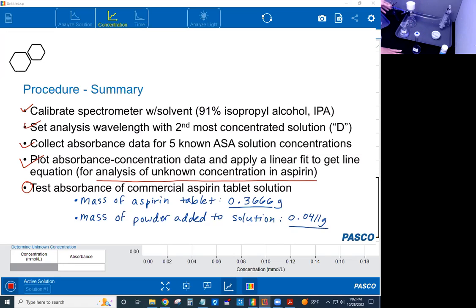If you don't have a professional vacuum system, you can set one up with just some tubing, 2 Erlenmeyer flasks, your Buchner funnel, and a one-hole stopper with a couple of one-way valves. This is the syringe that you get either in PASCO's pressure sensor or with the drop counter. It's the same syringe, so you can create a vacuum with it using this setup. So this is just the syringe, a couple of one-way valves, and tubing connecting Erlenmeyer flasks.